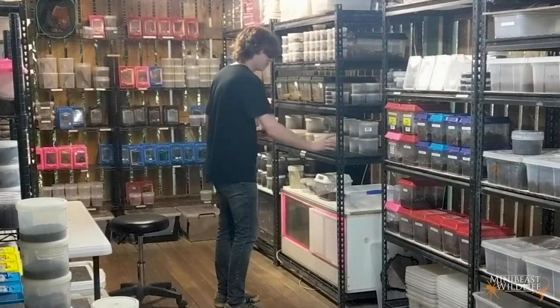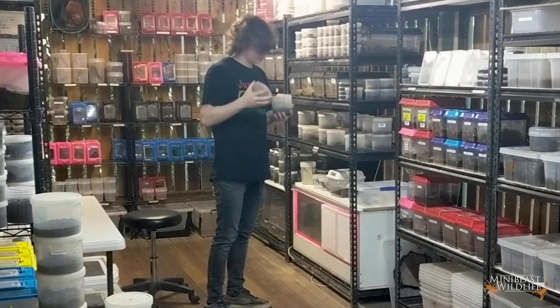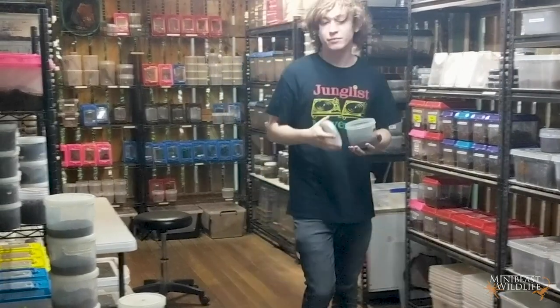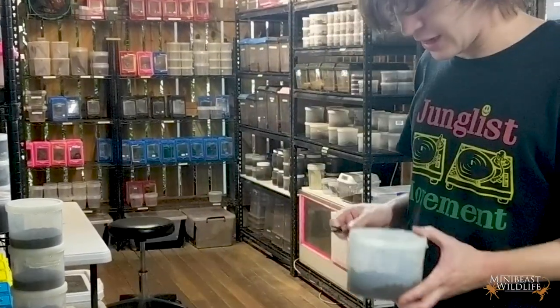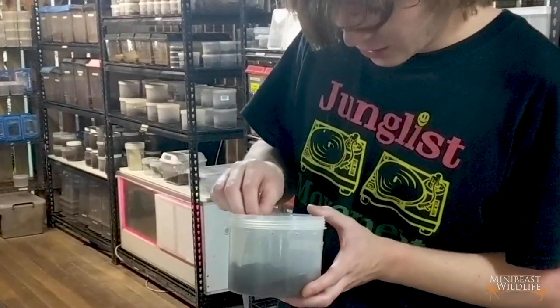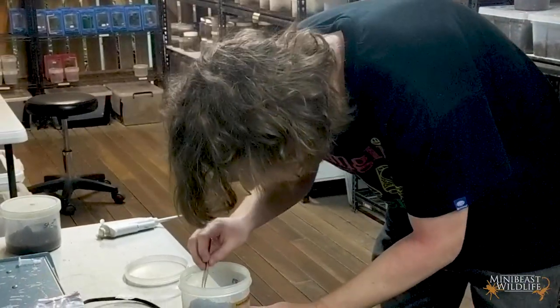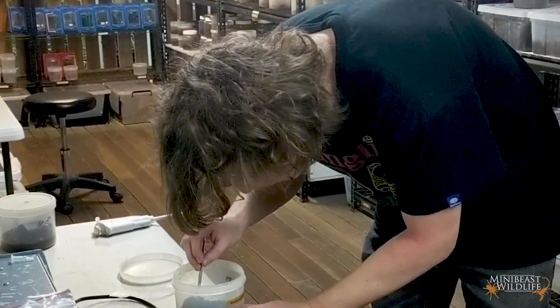All right, prepare yourselves. Milking scorpions for important venom research looks absolutely bizarre, but as we're about to hear, the scorpions aren't harmed in the process. Basically what we're going to do is get one of these scorpions out, strap them down on this sponge, and then electrostimulate the venom gland to get some venom.